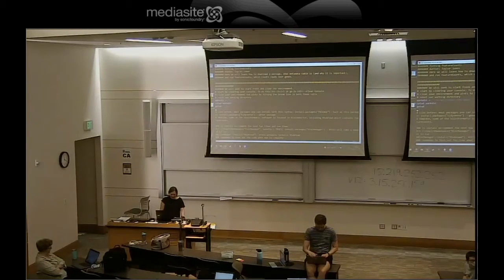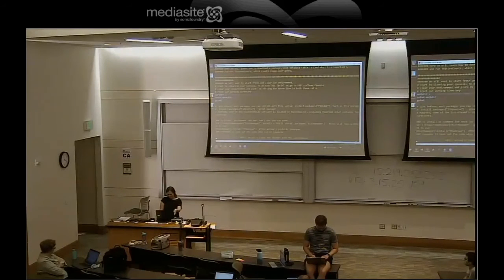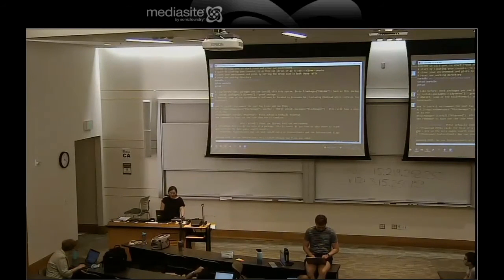We talked about packages. Here's install tidyverse. With Subread, you actually have to use essentially BiocManager, which is all that this hashed out part is. This library line probably looks familiar to you also. This is how you loaded tidyverse into your environment. So this is saying load Subread in so that you can actually run featureCounts.